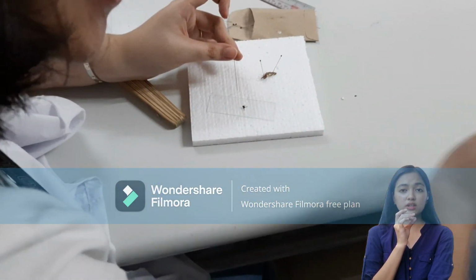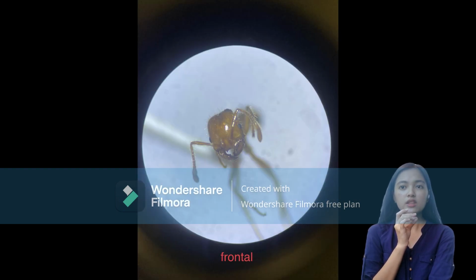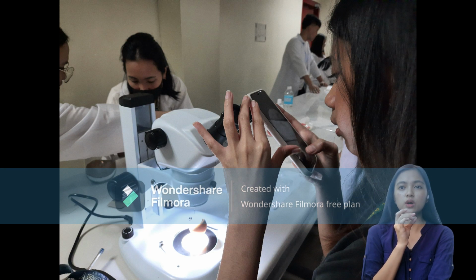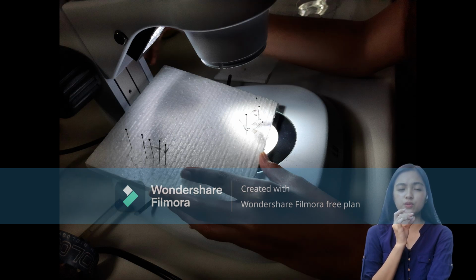They were viewed in lateral, which is the most commonly used view, in dorsal, ventral, and in frontal view. The use of different perspectives in viewing specimens enables us to have a comprehensive morphological analysis and proper species identification, since certain features may be more prominent or distinctive from specific views.